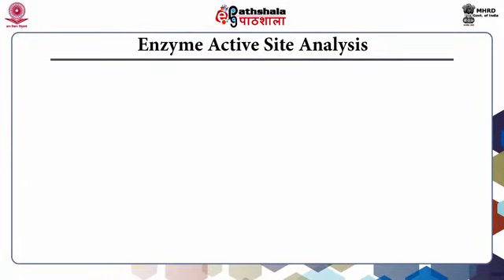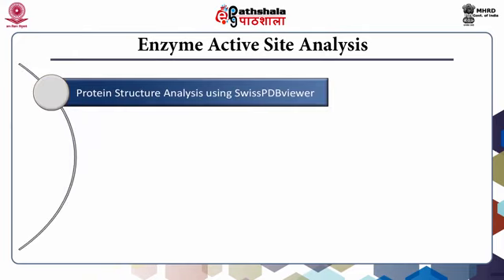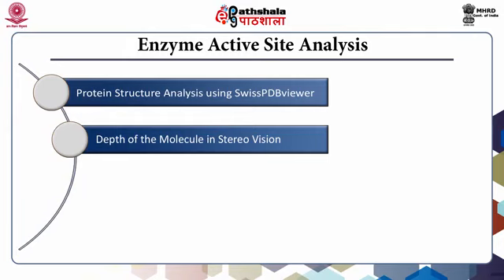Therefore, the learning objectives in this module are to undertake protein structure analysis using SwissPDBViewer and then to appreciate the depth of the molecule in stereo vision.